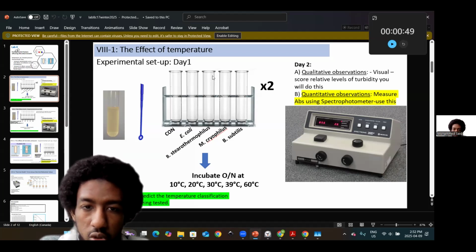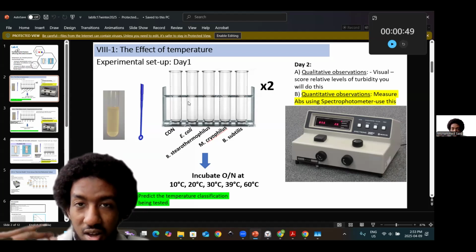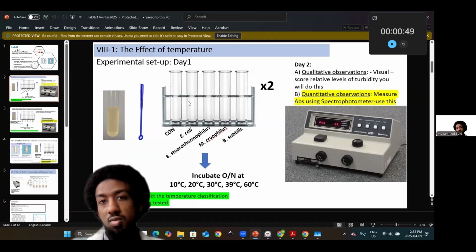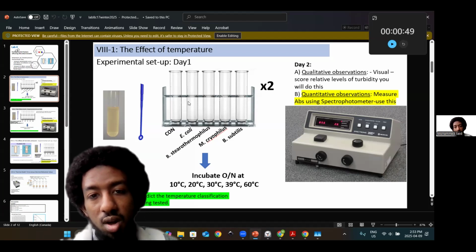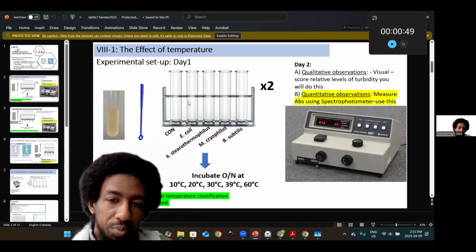And based on these results, you can imagine at room temperature, maybe the E. coli control doesn't have any bacteria. So between the four sets of bacterial conditions, maybe E. coli goes well, right? 37 degrees, 20 minutes generation time. So it likely was in log phase, producing quickly, especially after inoculating it for over 24 hours in this tube.